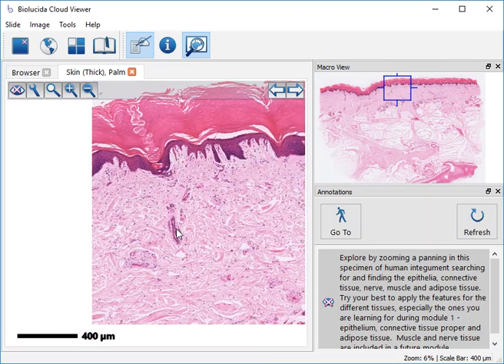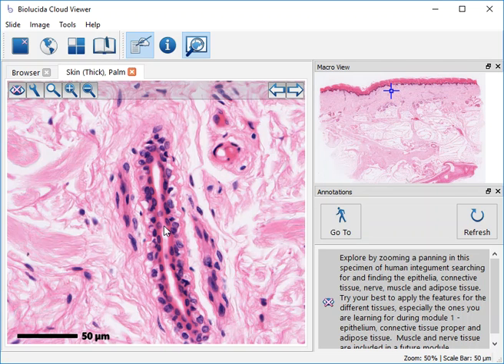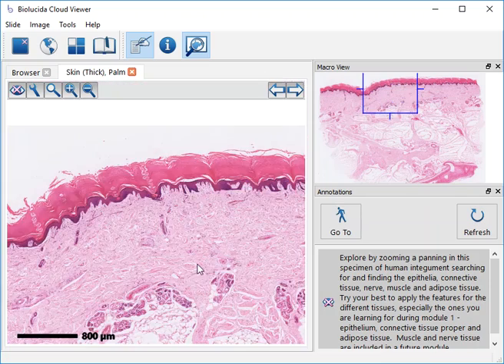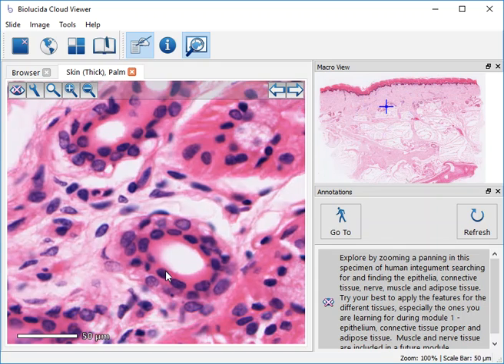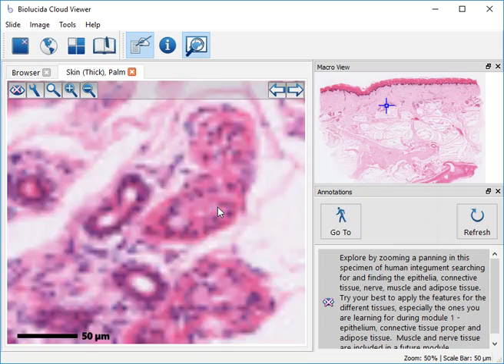And then the next over here is a duct. And actually it's a longitudinal section of a sweat gland duct that has 2 layers of cells, seen best right here, stratified cuboidal epithelium. You can find other examples of that down here in the sweat glands. Here are stratified cuboidal-lined sweat gland ducts, and over here are secretory cells of the sweat gland.